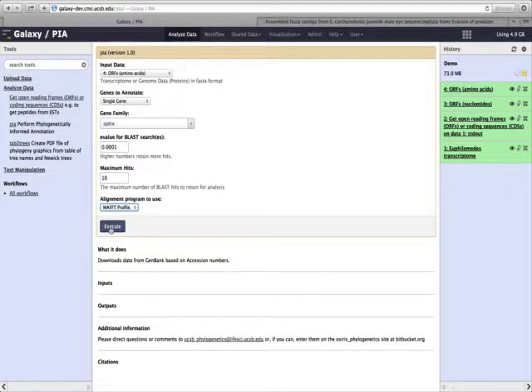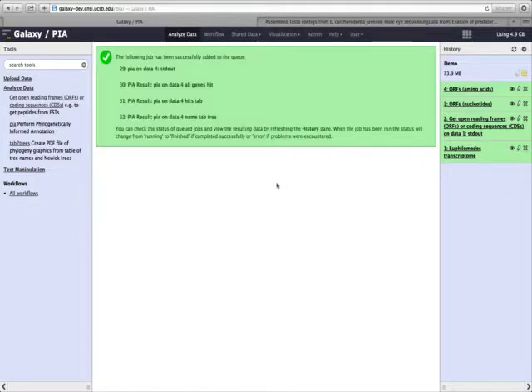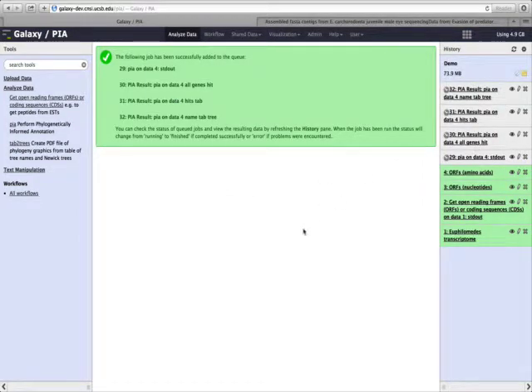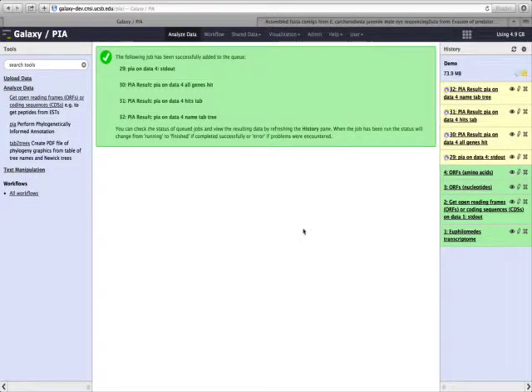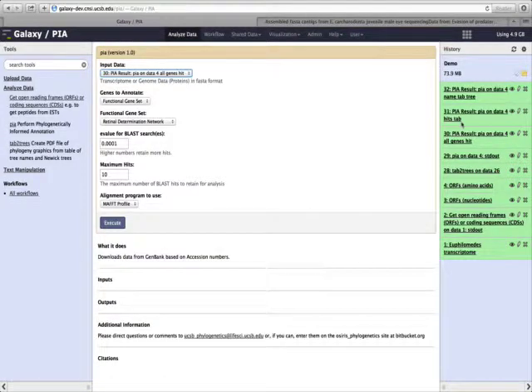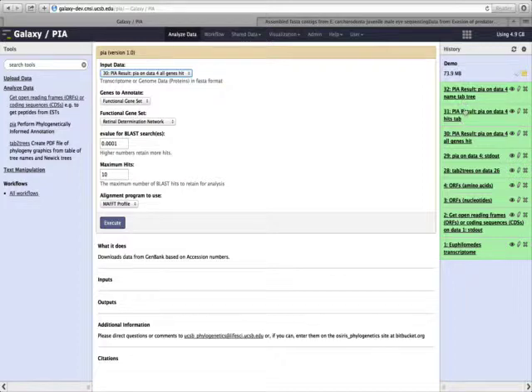Next, we hit Execute in order to start this tool running. Again, it turns gray as it prepares, then it'll turn yellow as the tool is running. And once it turns green, that means the tool is finished running.